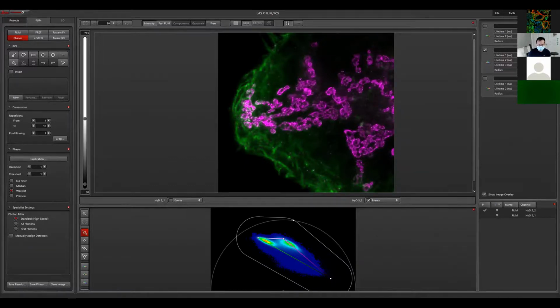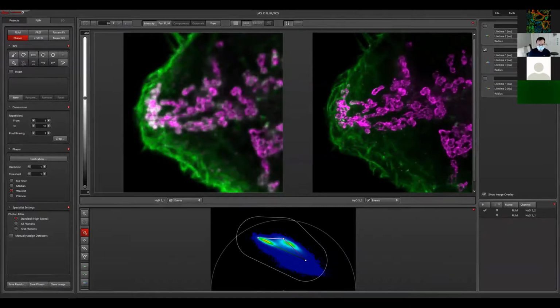I mean, let's put it like this, the way the automatic one is designed is that you always get a good result, reliably, without having to do anything manually. But of course, if you then want to dig deeper into it, you have all the raw data still at hand and can do that yourself. Mm-hmm. I hope that answered your question.